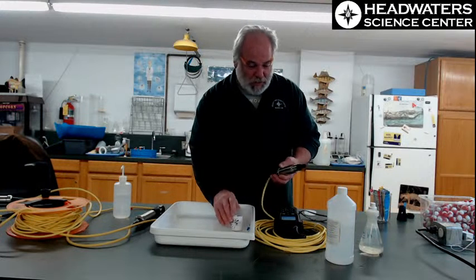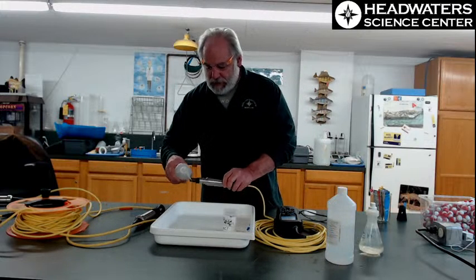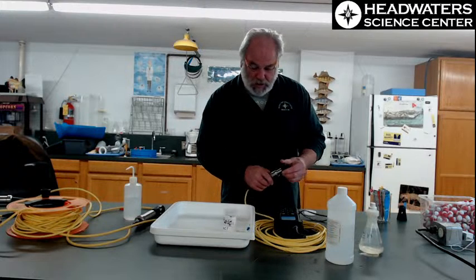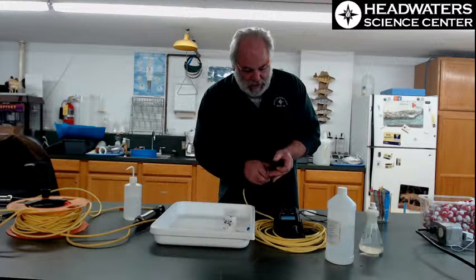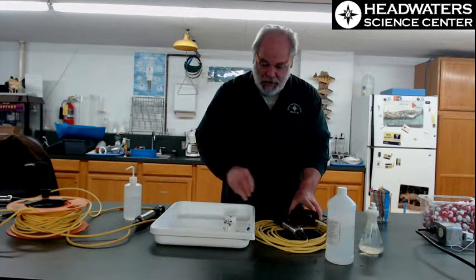So let's take this one away. Let's put the guard back on, clean it up. That's really just a sodium chloride solution, but it's been preserved into its good form. Put that back on, and then we'll do our final calibration for dissolved oxygen.